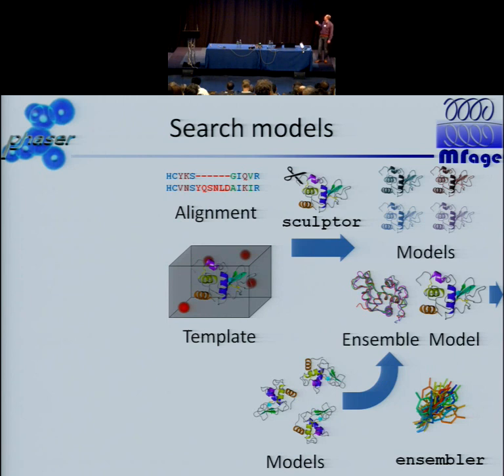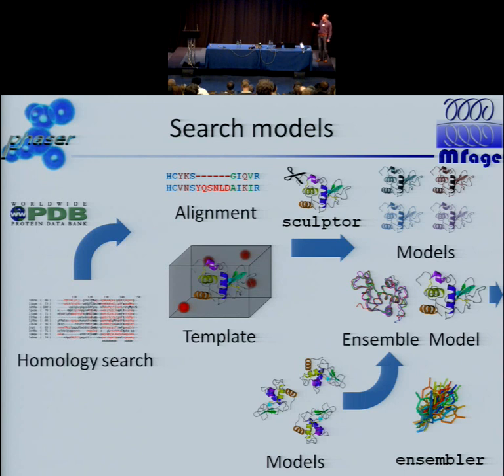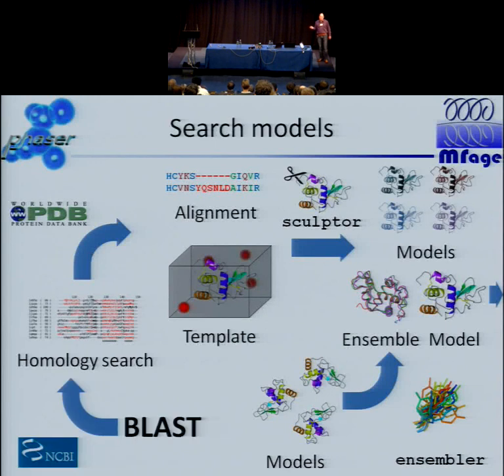So you get a number of structures that sometimes work better, and this is something I'm just going to show later. If you do not even have templates, you can just start with the homology search, and we accept a certain number of formats, and then the program will use the wwPDB to pull the templates and pull the alignments from the homology search.